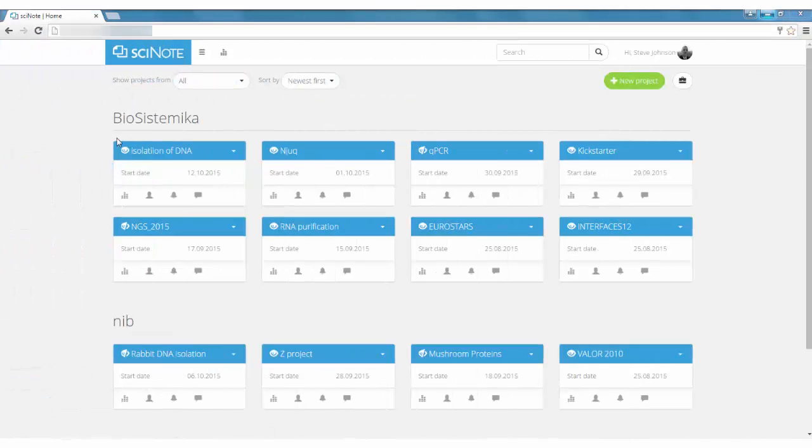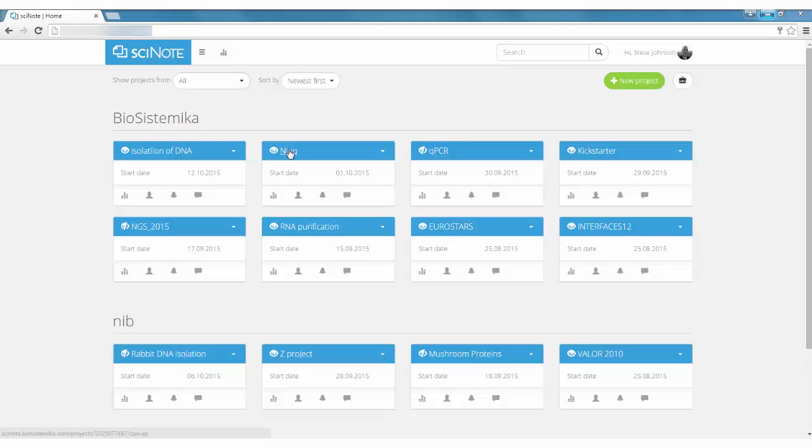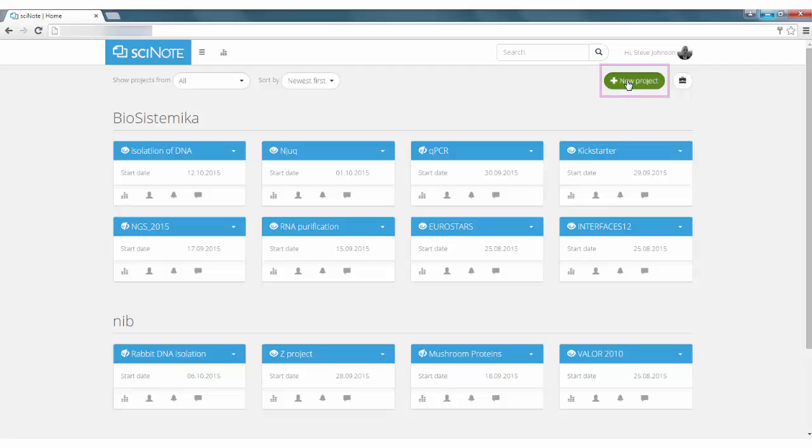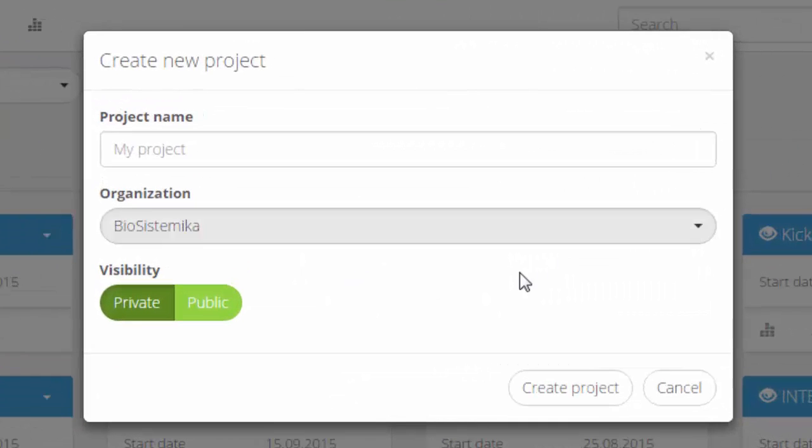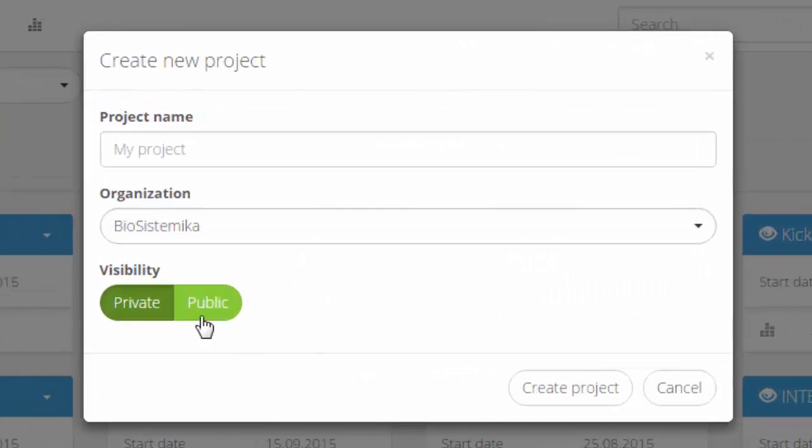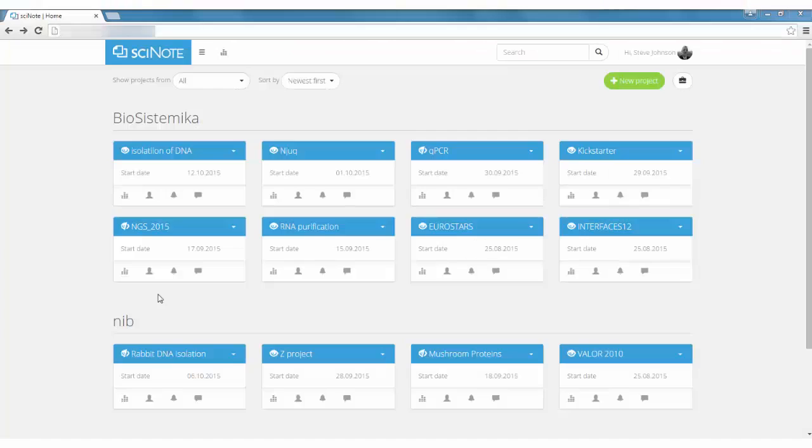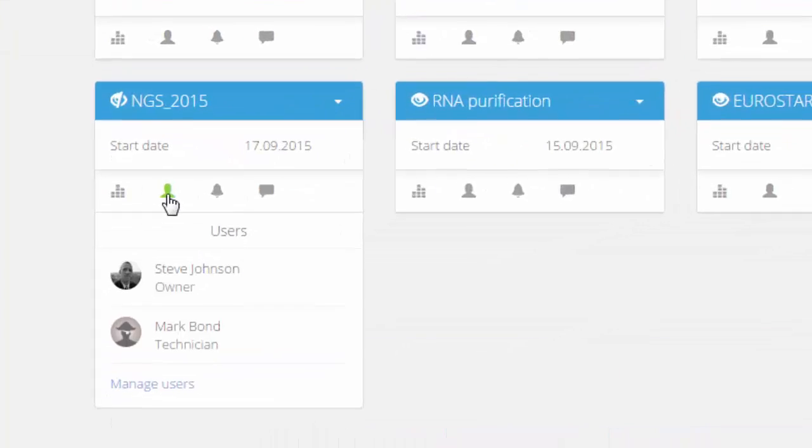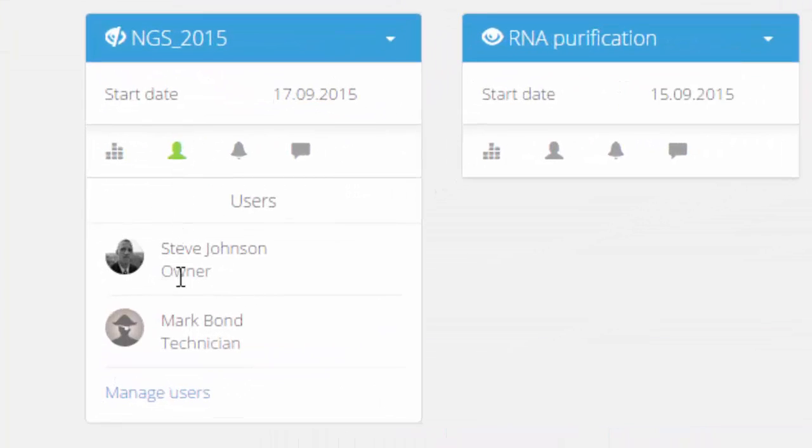Your work in SciNote is organized in projects. To start a project, create a new project on a dashboard and make it visible to the entire team or only to project members. You can also invite others to contribute.